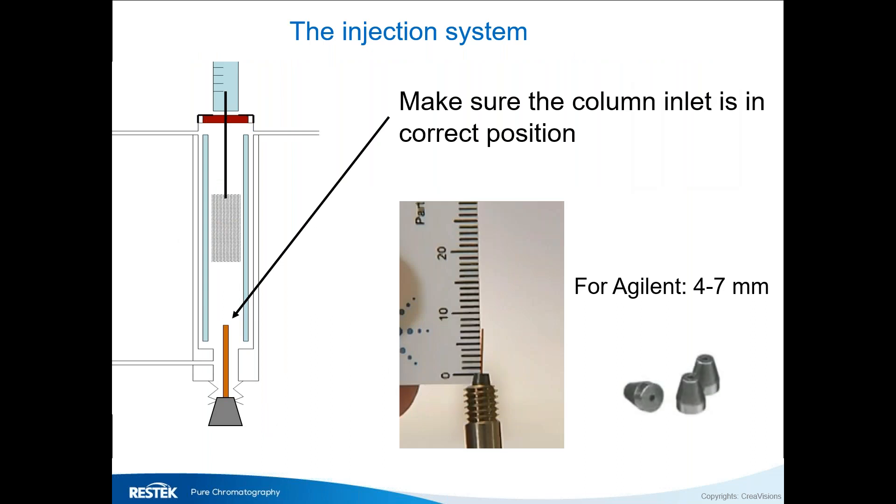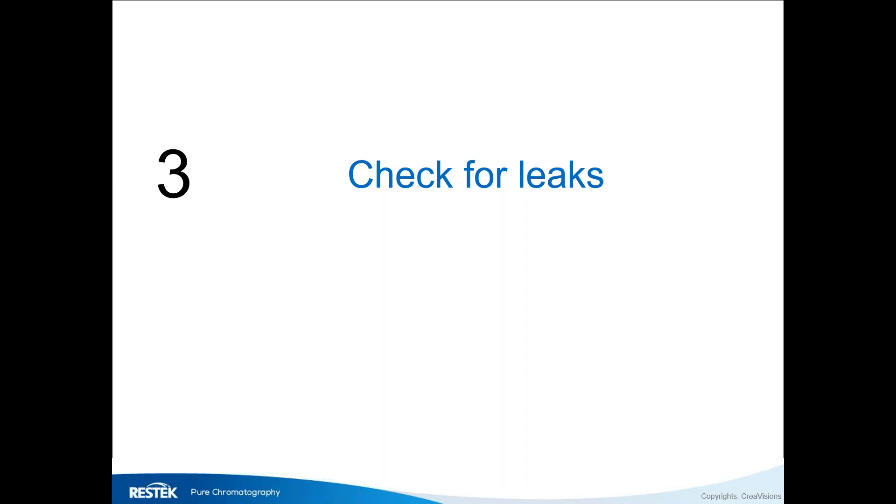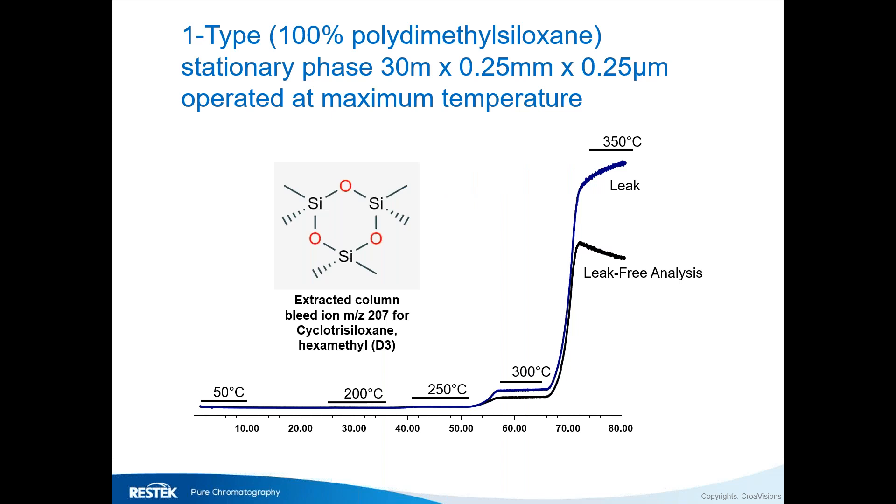Next, check for leaks. In a column we have only a very small amount of stationary phase — a 0.25 micron film over 30 to 60 meter column lengths. When there's oxygen or water in the carrier gas, it will attack the stationary phase and cause more column bleed. When you run a temperature program, if the baseline increases exponentially and keeps creeping up slowly at the final temperature, that's an indicator you may have a leak.